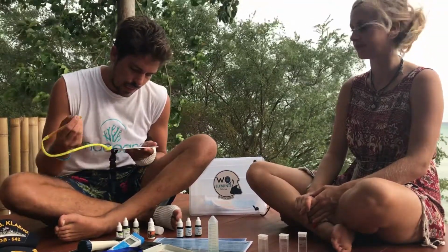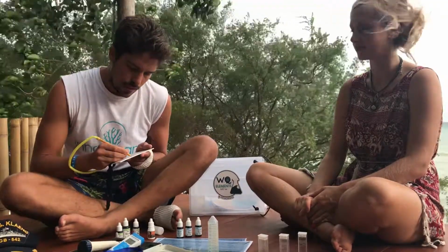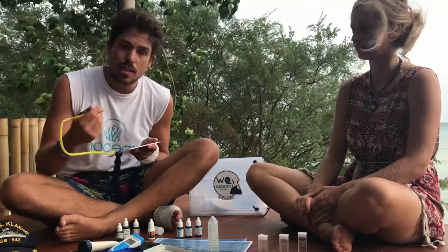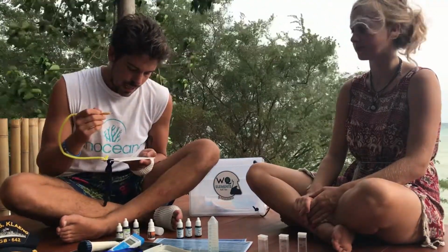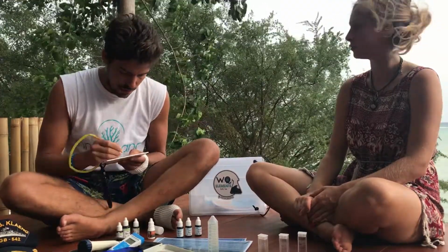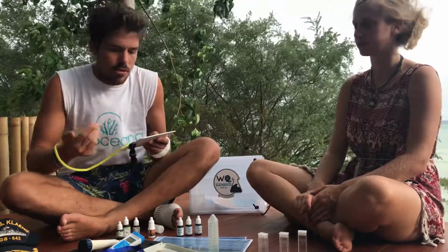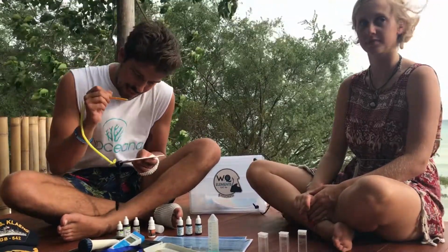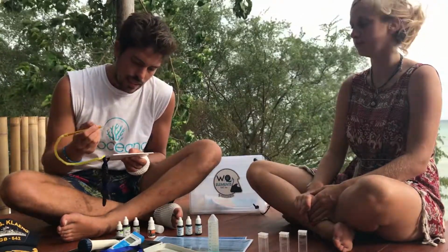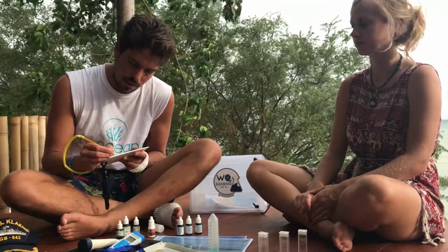Then, in the time in, that is when we take the sample. This was at 16:20. And the time sampling is going to be the time now, and the temperature when we took the sample, it was on the shore, it was 30 degrees, so I'm going to put in the temperature inside the water 30 degrees. Optional, you can put the temperature outside the water, but important is the temperature inside the water. And the last thing I'm going to put, in this case is 0 meters depth, so I'm going to put in the depth 0 meters.